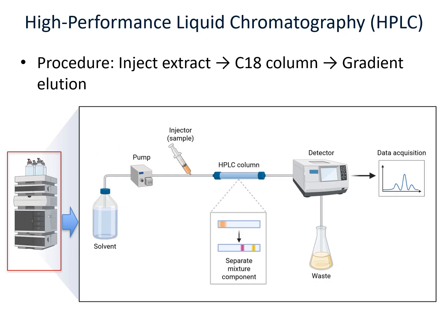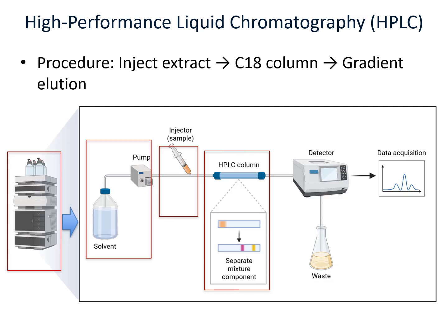Now, what happens is that the pump usually pumps the solvent at high pressure and mixes it with the samples that are being injected and passes them to the HPLC column at high pressure.